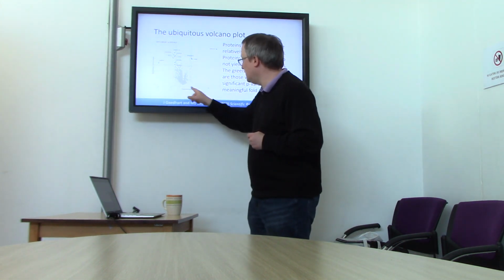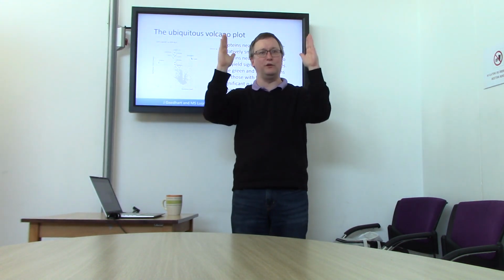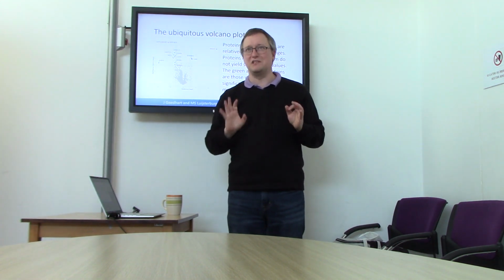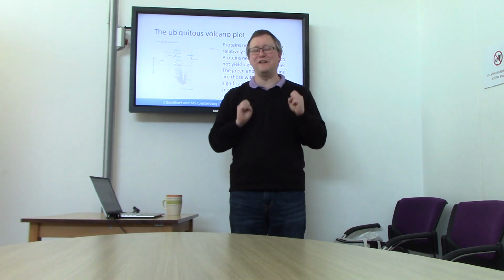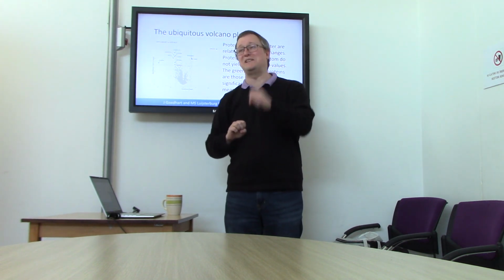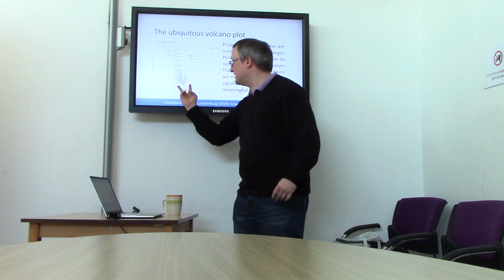When we use this, we're putting some limits on things to say, we don't care about fold changes less than this. And this is the part that statisticians actually hate. They hate it very, very much. But biologists frequently tell us, we don't care if it's up by 10%. That's not biologically meaningful. That's what these 2 lines mean.